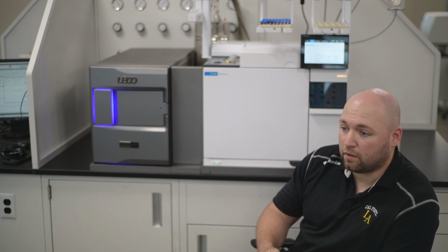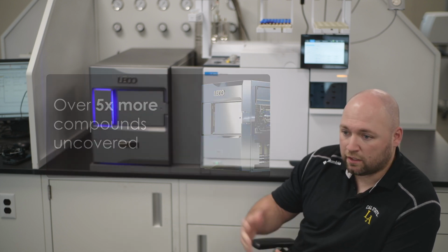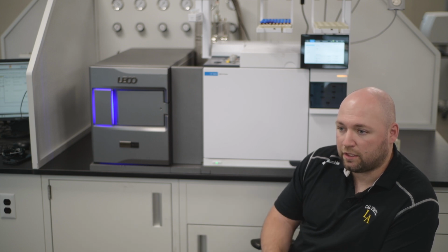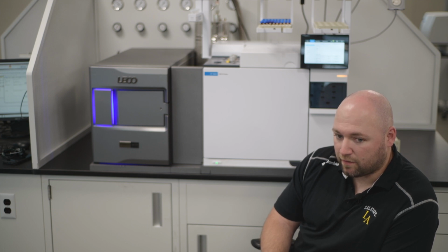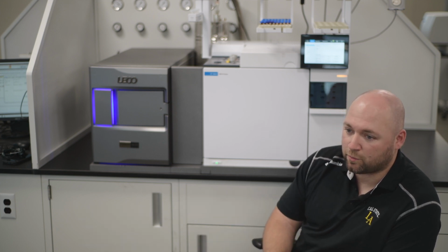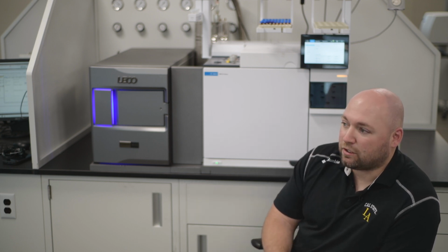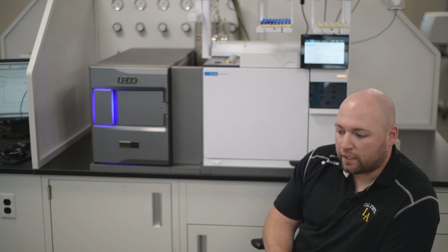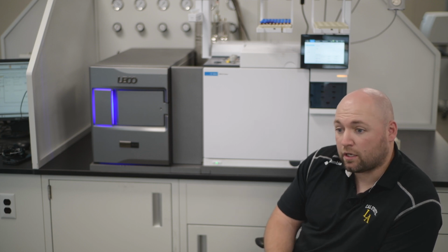sample preparation. Right before I came here, because we ran the samples yesterday, I compared the fingerprint samples. For the fingerprint samples, we find 5.5 times more compounds than using our BT2. And that's pretty interesting because I think that whatever you quote, the sensitivity is 5 times more. So it was actually funny to see that number. And then for the soil samples, we're going to look into them in a little bit, but again, way more compounds, and the intensity of some of these is also larger than whatever we found using our instruments.